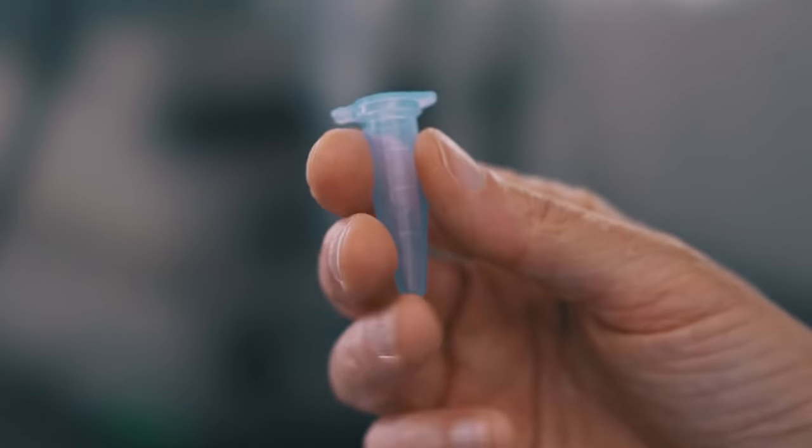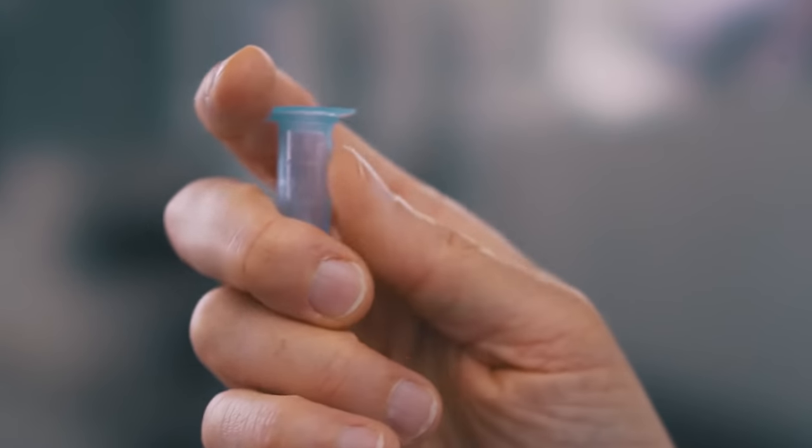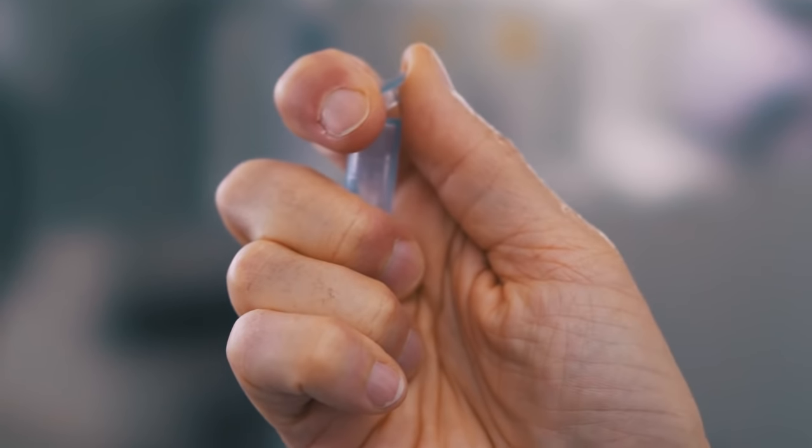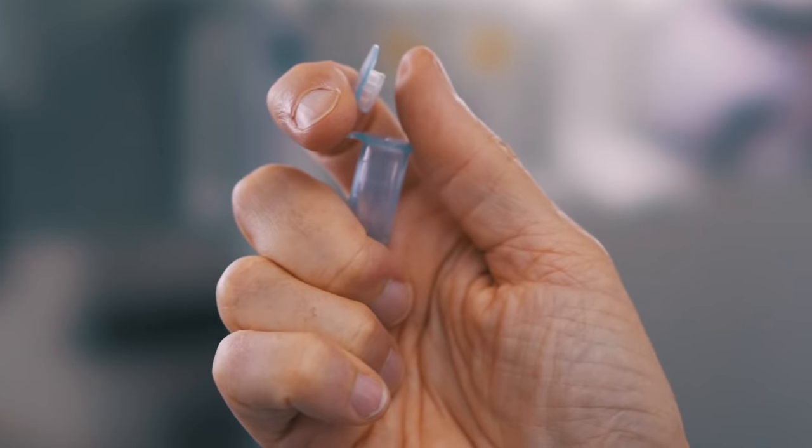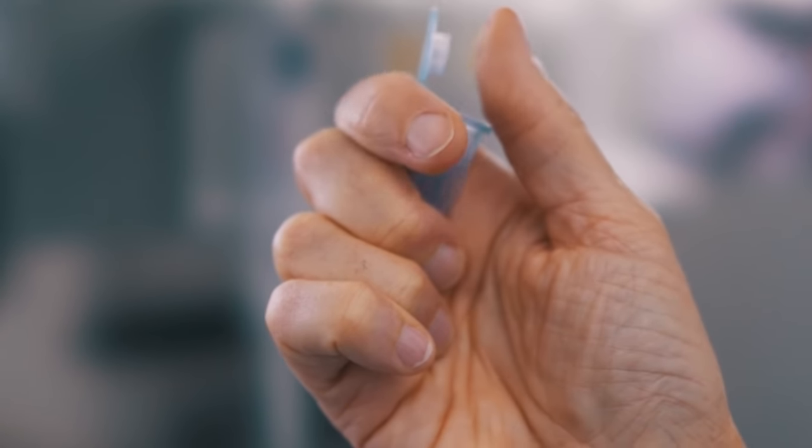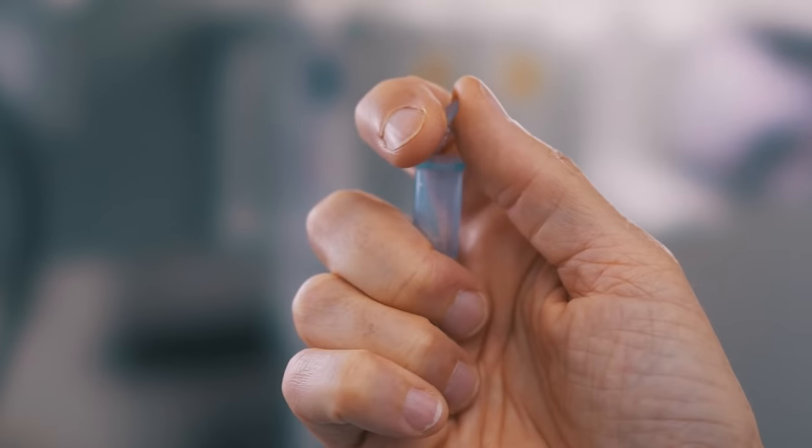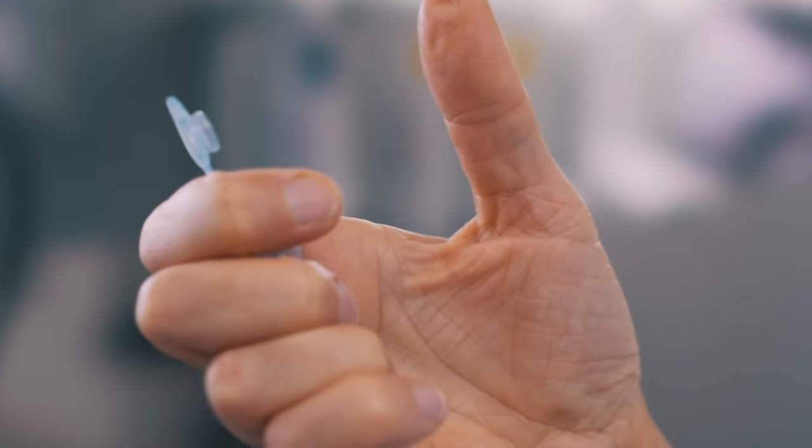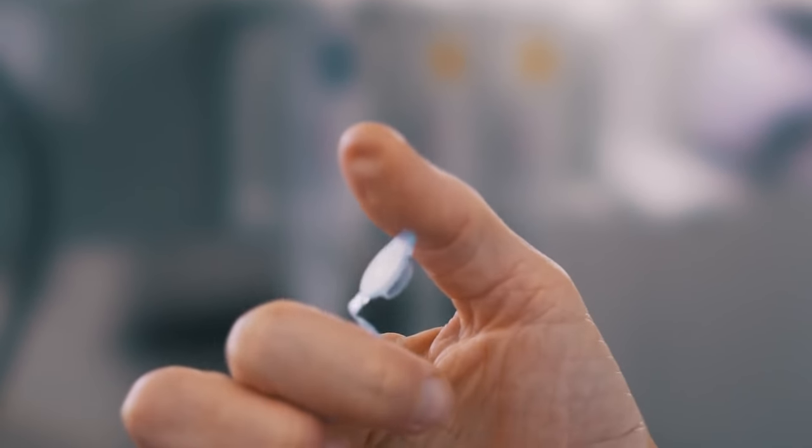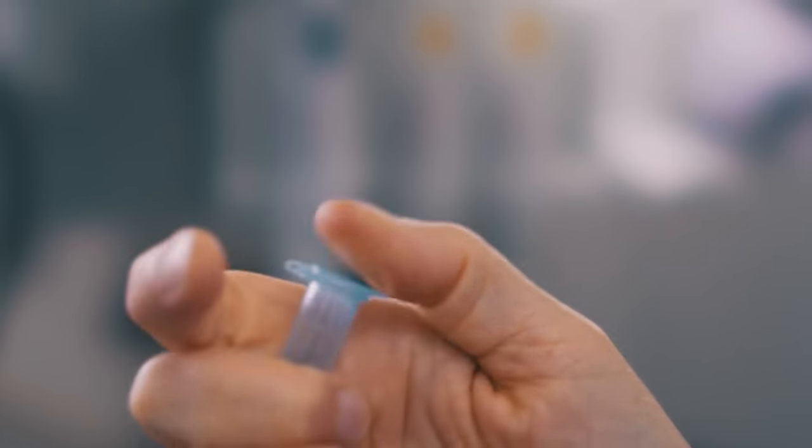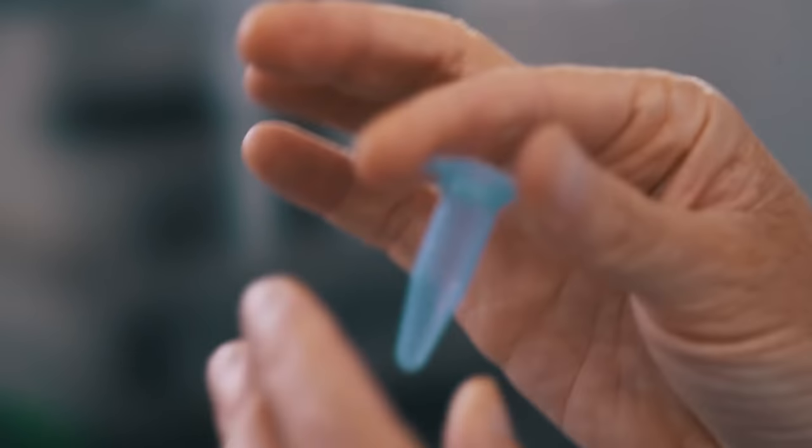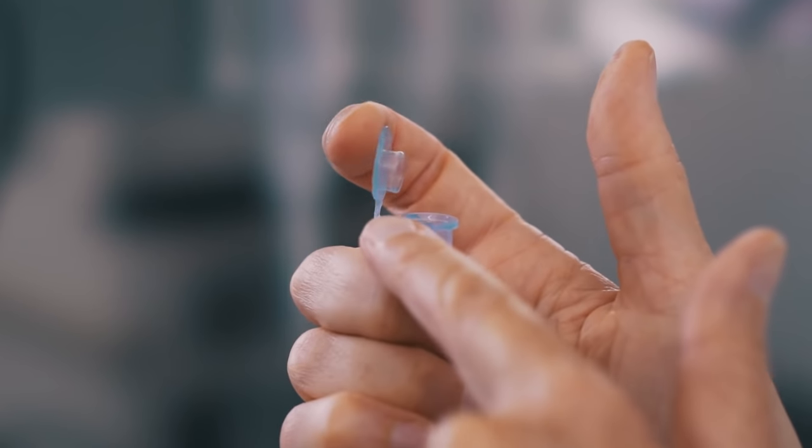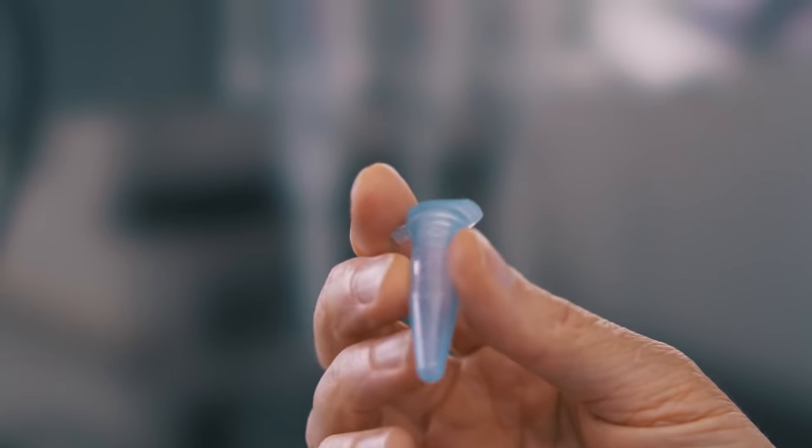The way that you should not open one of these tubes is one handed. It's very tempting to hold the tube like this and to open it with your thumb. But when you do, often enough, your thumb is going to hit the underside of the lid. And when that happens, then you have the DNA or whatever was in the tube on your thumb. And as you go to close the tube, as you touch other things, opening another tube, then you have transferred what was on your thumb to that cap and contaminated whatever you're working with.